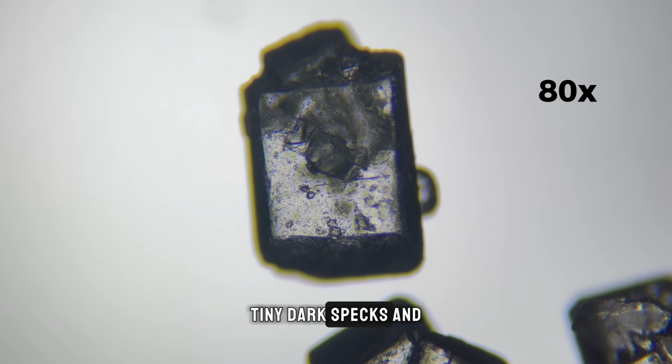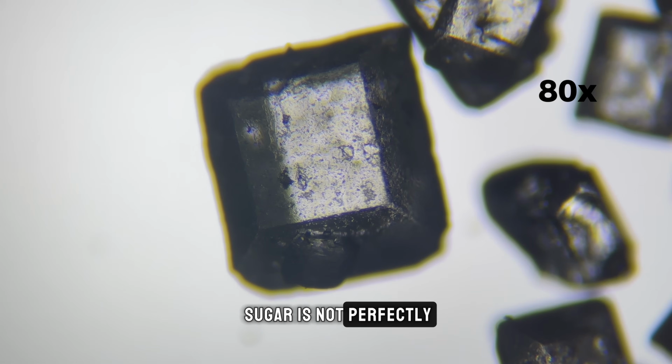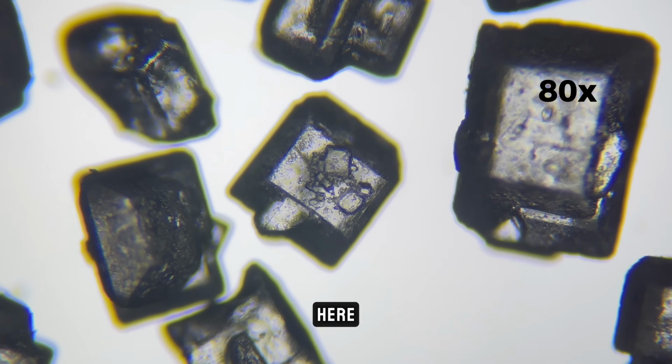Tiny dark specks and faint surface marks appear across the crystals, showing that even refined sugar is not perfectly clean or uniform. The edges are crisp and rigid with no softness or flexibility at all. Unlike fruits or sauces, there is no sign of moisture or flowing structure here. Everything feels solid, dry, and brittle.